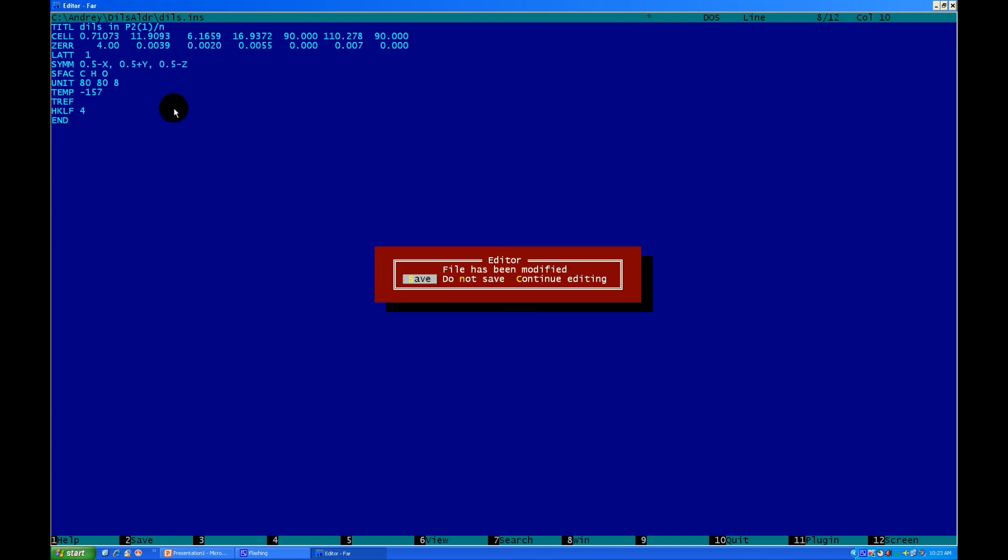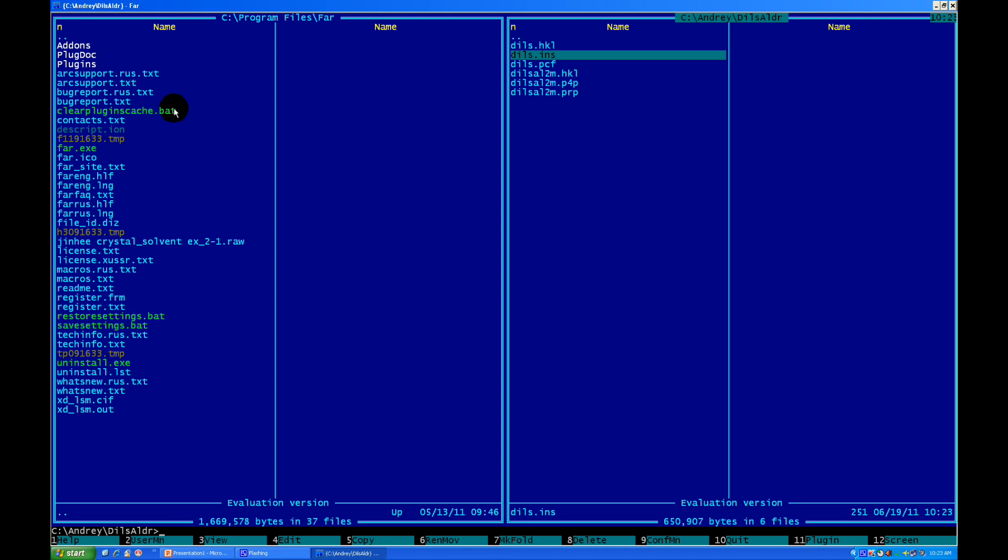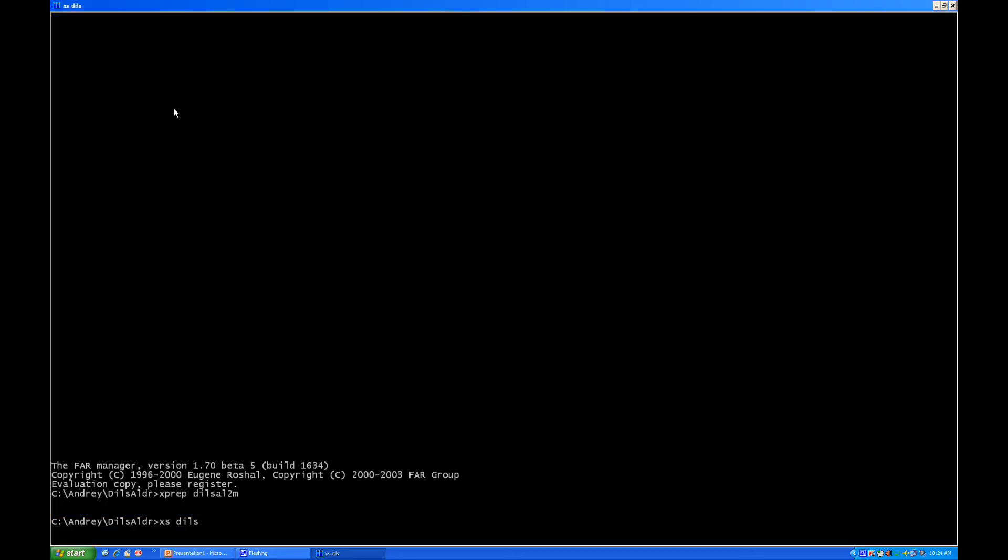Right now, you're pressing escape. The program asking you to save it. You press enter. Yes, you wanna save it. Right now, let's do actual crystal structure solution. To do so, what you need to do, it's type xs, x-ray solution, and the name of file. In our case, it would be Dils. D-I-L-S. And, press enter. Some crystal structure solution happens.